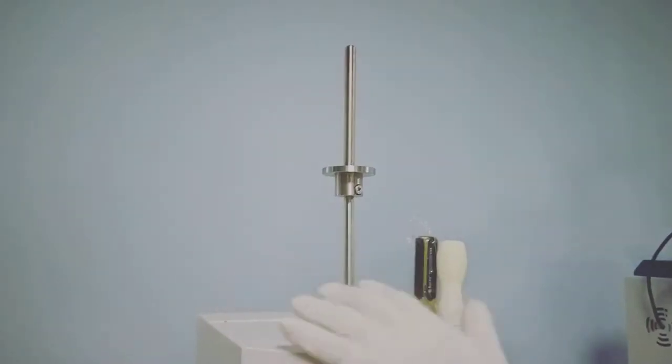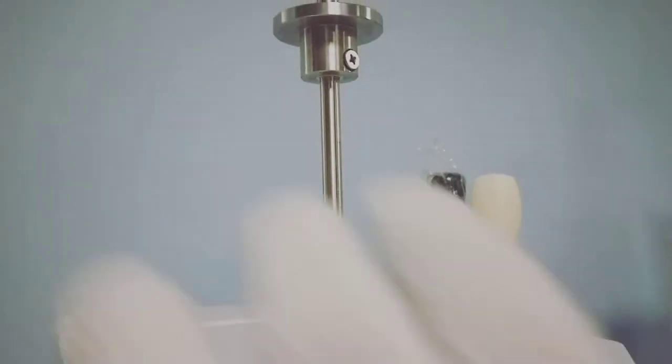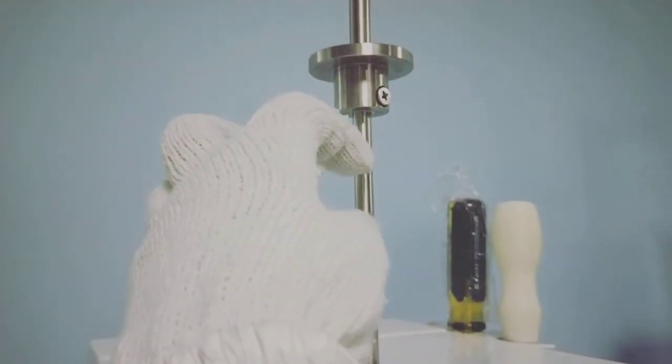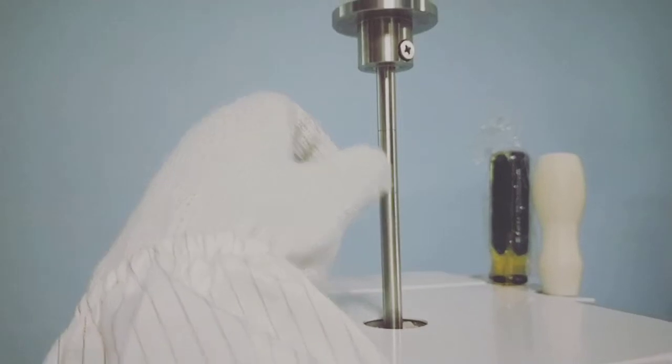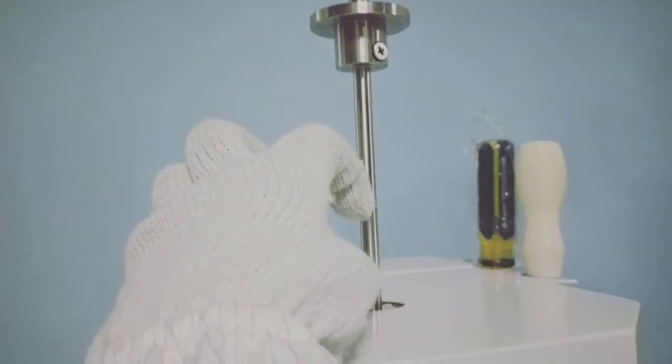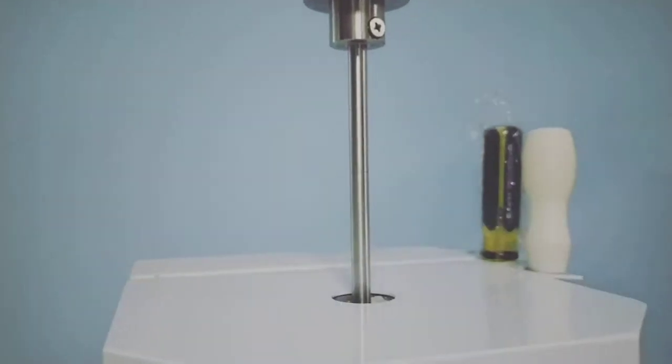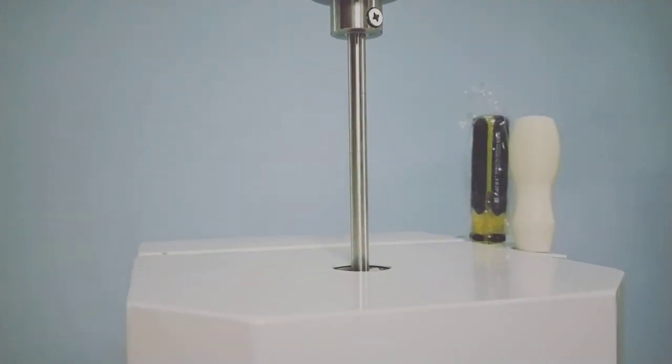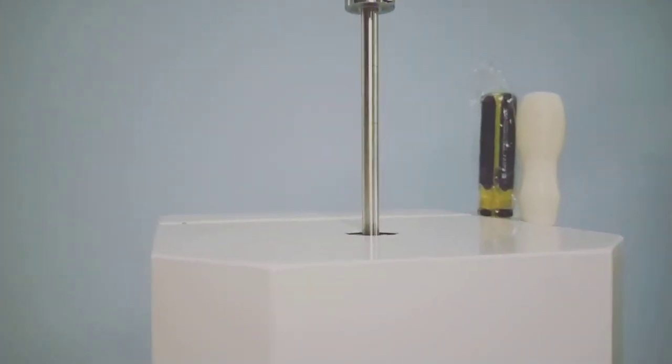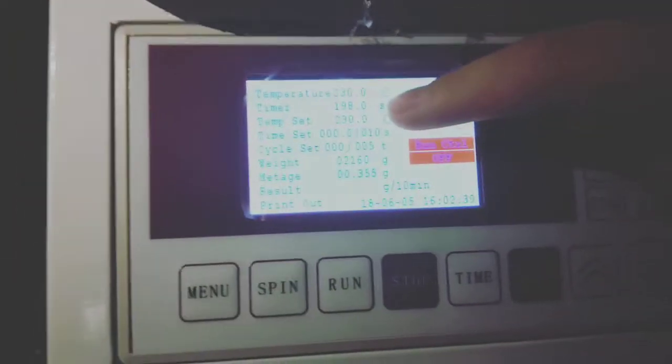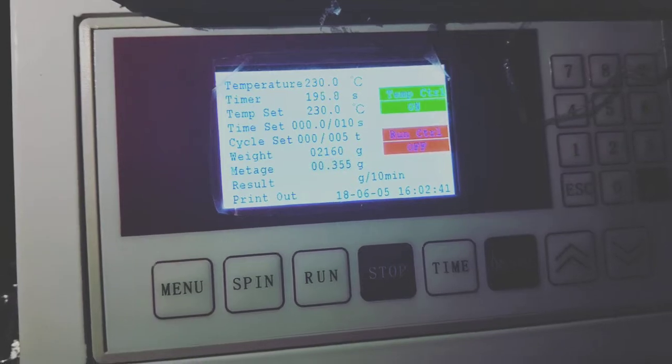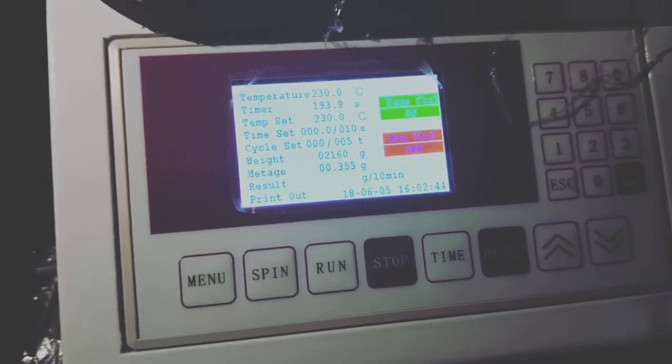We can see there are two curves on this rod. Normally we automatically cut the sample when the rod moves from this curve to this curve. During the bottom, this place sample is extruded, we manually cut and do not use. Now we need to wait for this time to calculate to zero. And then we can add the sample and extrude the sample.